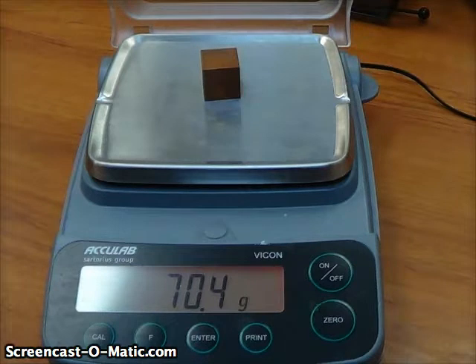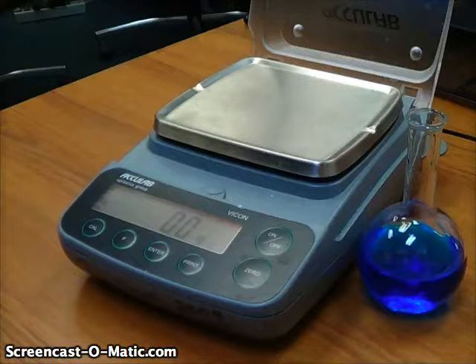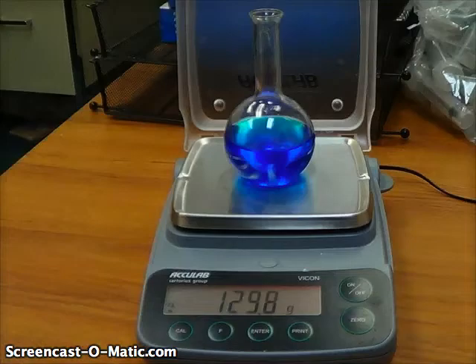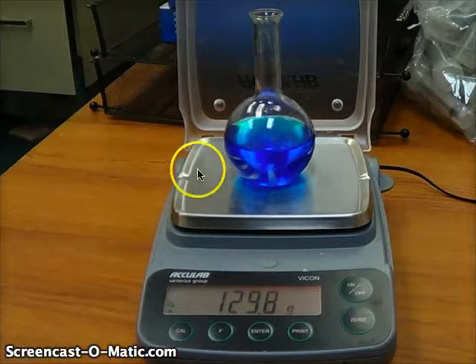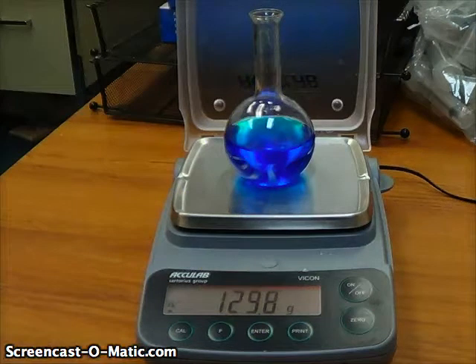Now one thing we want to look at is how we might measure the mass of something that doesn't fit on that tray very well. For instance, if I want to measure the mass of this blue liquid, I can't just pour that on the tray — it would get inside the balance and mess with the electronics. And I can't just set the container on there, because that 129.8 grams is the mass of the container and the liquid combined. I only want the mass of the liquid. It turns out there are two ways to do this, and we are going to look at both of them.